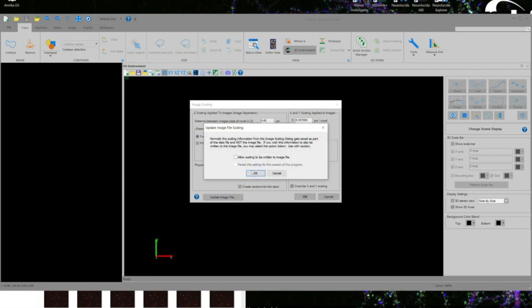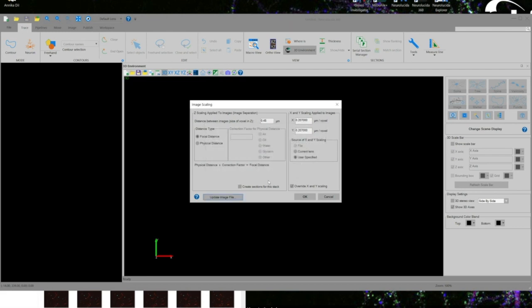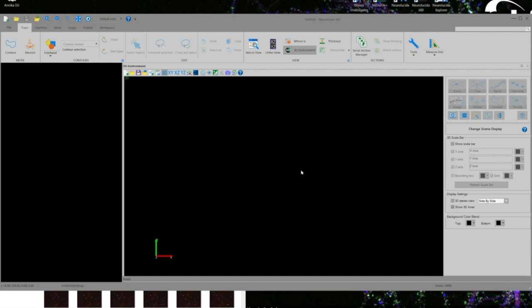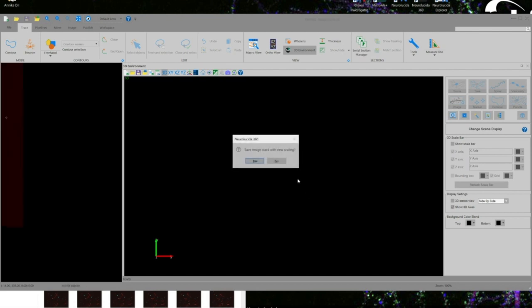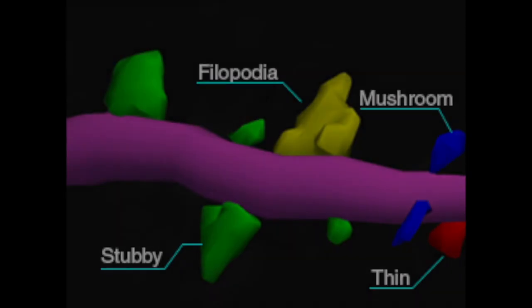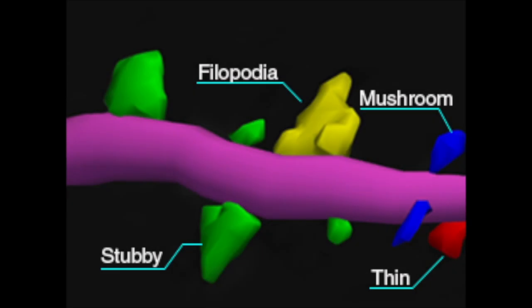We'll then update our new image file allowing the scaling info to be written into the file itself for the duration of the program. We will then save this new image stack with all of the correct scaling information which is an incredibly important step when working with fine neuronal structures such as dendritic spines.